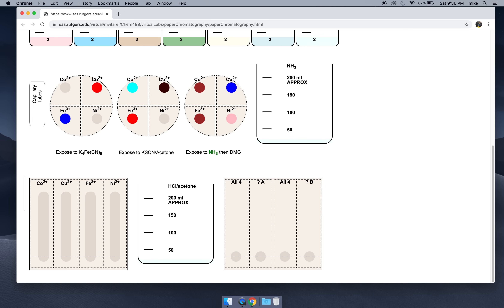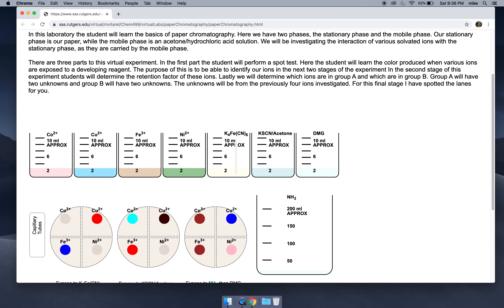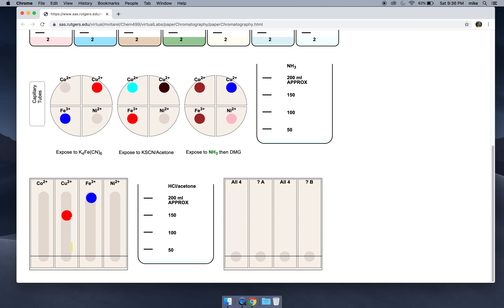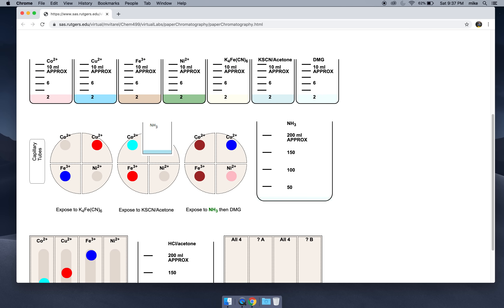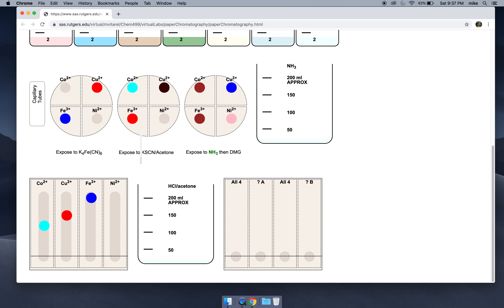A couple minutes ago we wrote down the best developing reagent for each ion. For copper and for iron, we picked K4FeCN6, so our copper ion and our iron ion appear. Let's go get our KSCN to find our cobalt — there's our cobalt. And lastly, let's expose this to some ammonia to make it basic, then get a new capillary tube with DMG. And there — now we can determine the retention factor.